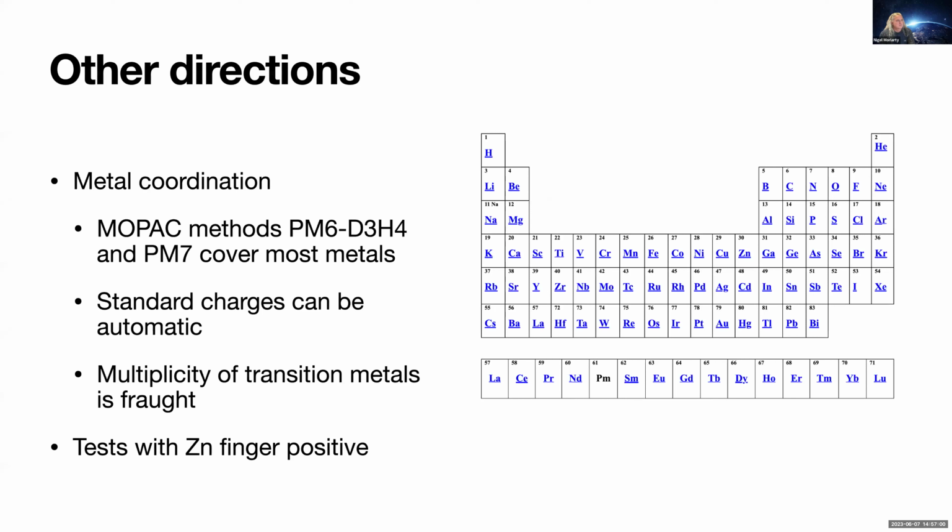Some other directions I've been playing with is metal coordination. It's very nice that there are so many different metals that have been parameterized for PM6.